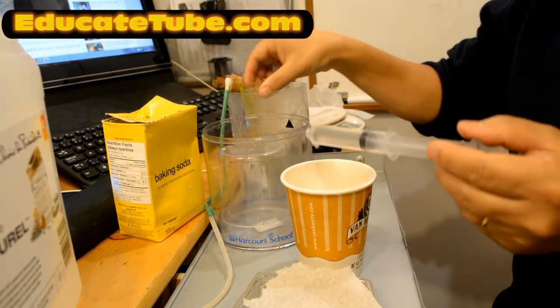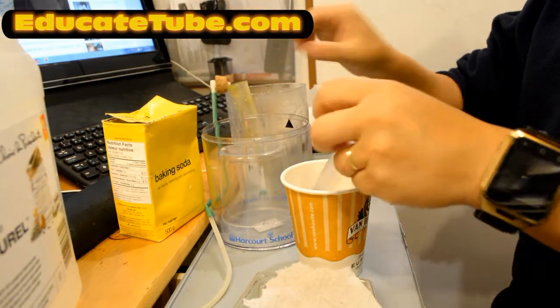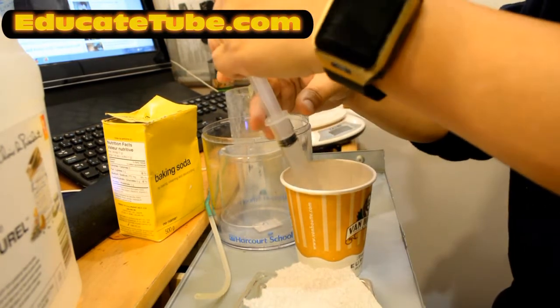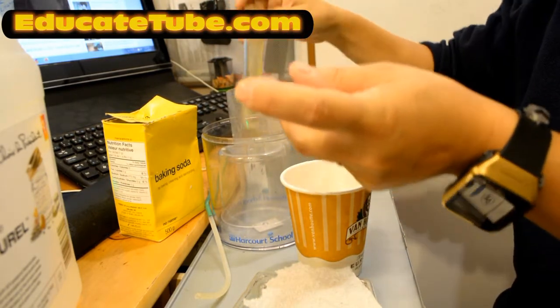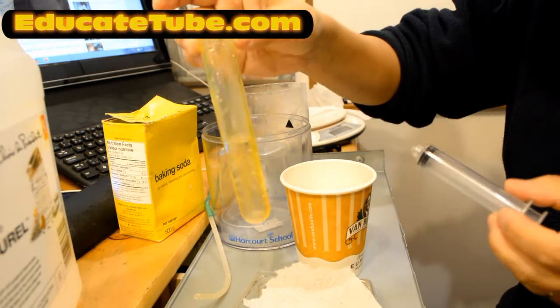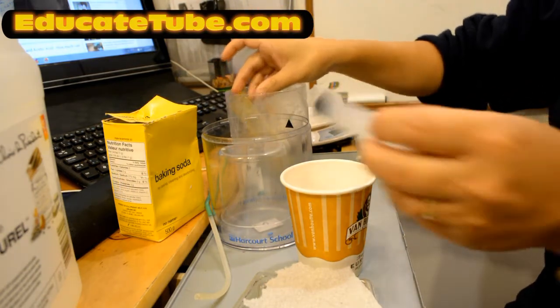Okay, there's 10 ml here. I'm going to put 10 ml inside this test tube. Another 10 ml. That's 20 ml. There we go. This is 20 ml of acetic acid, 5% acetic acid, which is vinegar. So 20 ml of vinegar, 5% acetic acid.